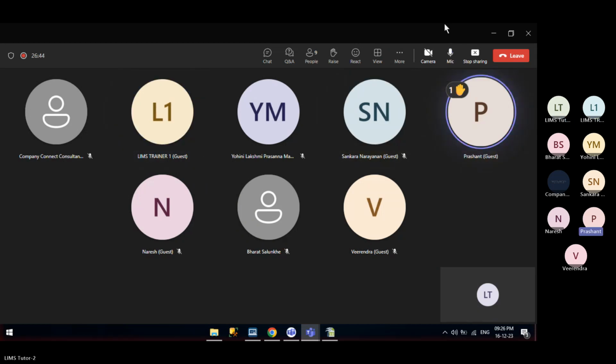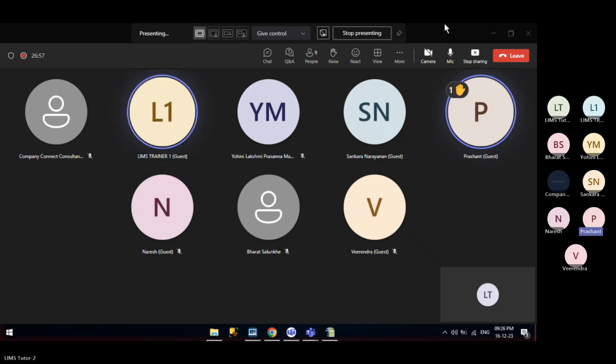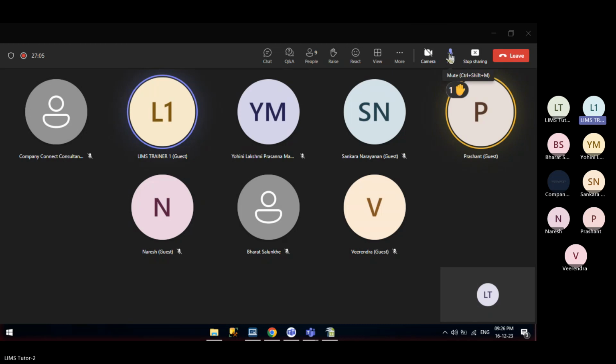My specific question is related to the analysis data of that product. They analyze on the instrument or do any chemical analysis, and then they record it into the data sheet. So how will that be handled in the LIMS, if I'm going paperless with LIMS? Yes, we can generate that through the sample report. Whatever analysis you are doing will come through a sample, so everything will come onto the sample summary report. We will cover that in the overview of lot management.